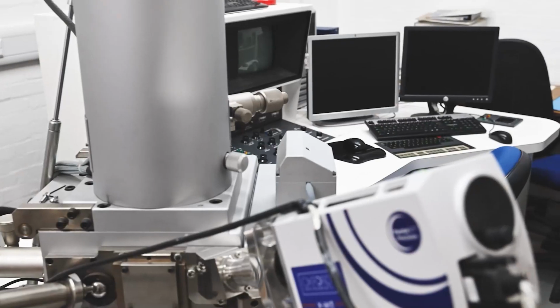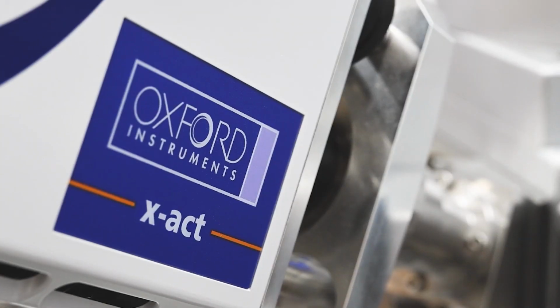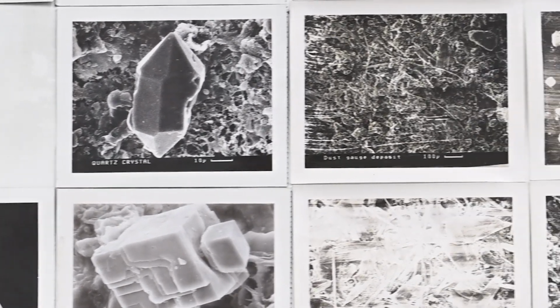We'll probably put it on our scanning electron microscope, which has an energy dispersive X-ray analyser attached. That will give us an elemental composition between carbon and uranium. After all this analysis is done, then we formulate what this material could be.